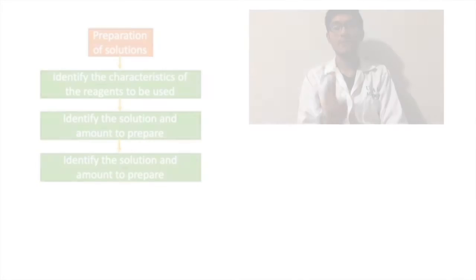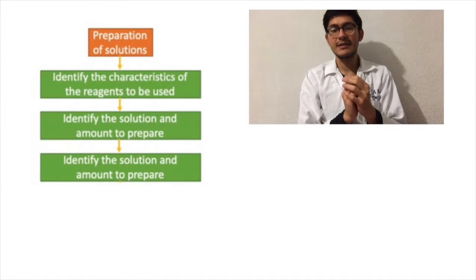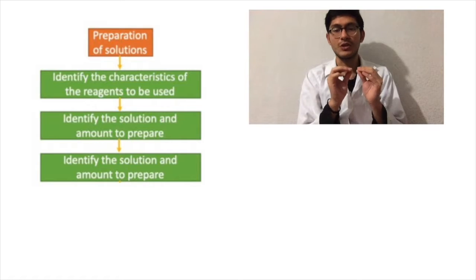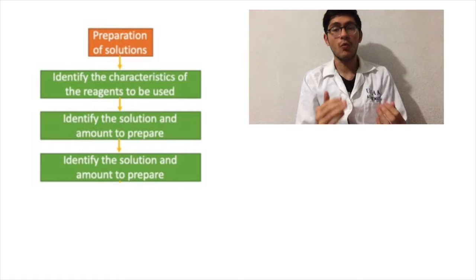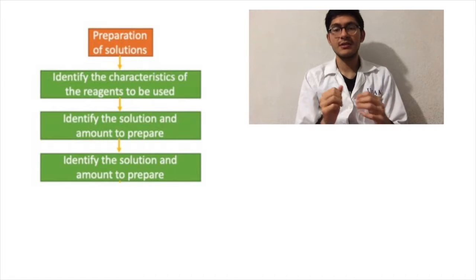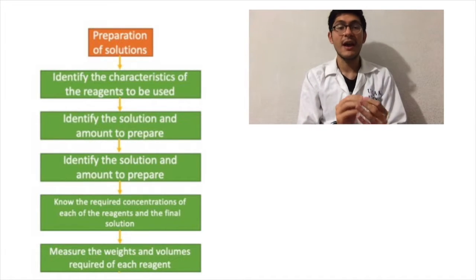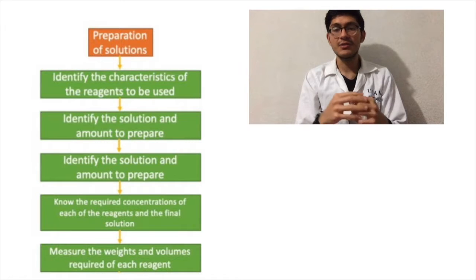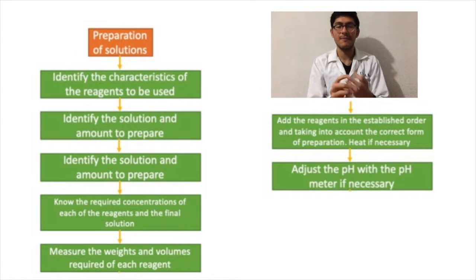A solution is a homogeneous mixture that is formed from the combination of two or more substances, known as solute and solvent. The solute is the substance that is found in the least amount, that which is dissolved in the mixture. Meanwhile, the solvent is the substance that is found in greater quantity, that in which the solute dissolves. In order to prepare a solution, it is necessary to dissolve a certain amount of solute in the solvent. However, it is important to take into account the solubility of said solute, since it will determine if the solution is saturated, unsaturated, or supersaturated.